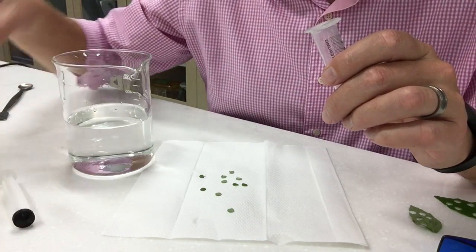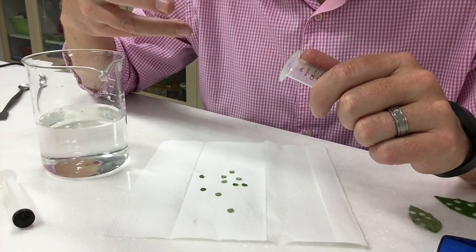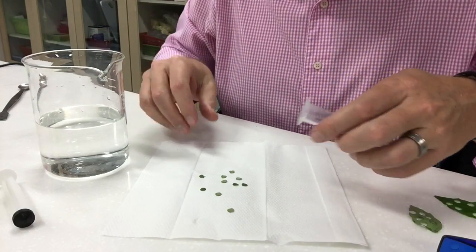The detergent is basically going to help when you evacuate the air out of the leaves that the detergent helps to get those bubbles off the leaf so that they sink a little bit better.